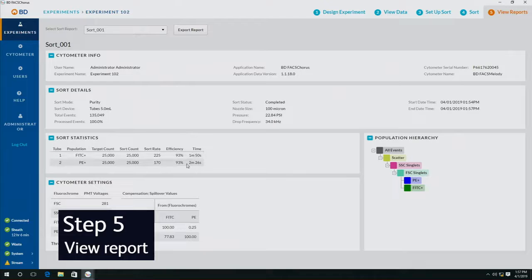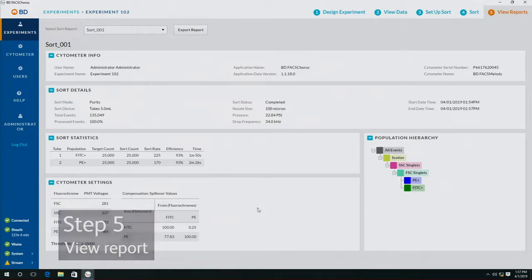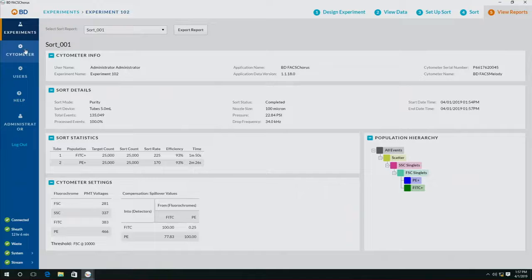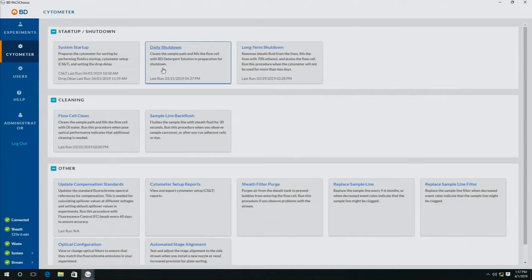And we can now export this as a PDF and keep it for our records. The tube has downloaded and we're now done with this experiment. At this point you could repeat the sort, do a new sort, or shut down the machine with the two simple modes to shut it down: the daily shutdown or the long-term shutdown. For more information about the BD FACs Melody, please consult the BD Biosciences website or consult your local sales representative.